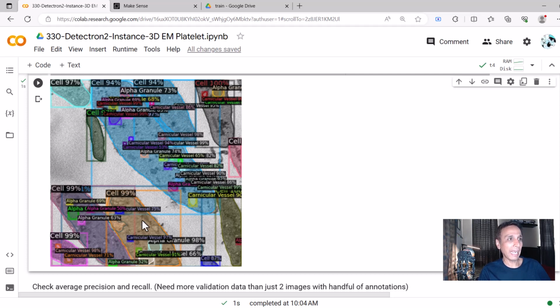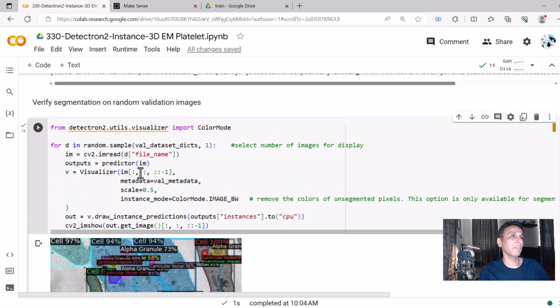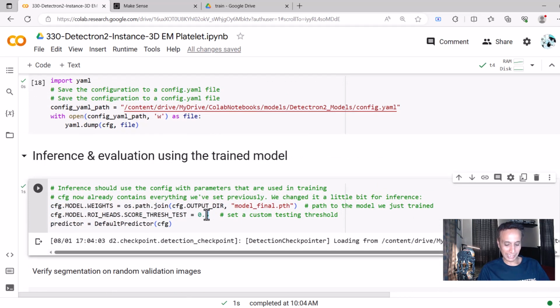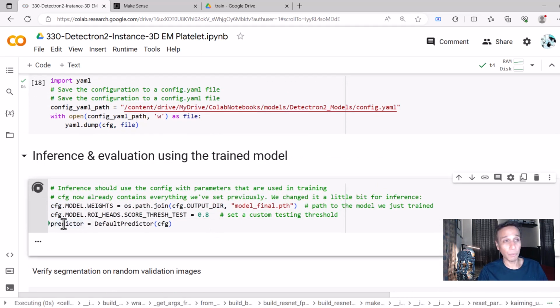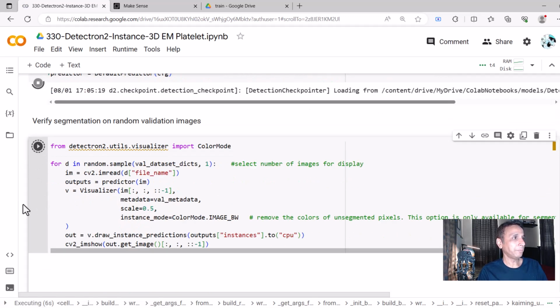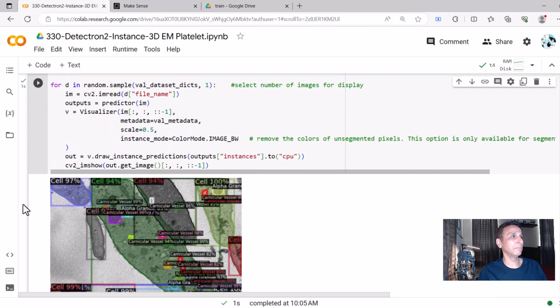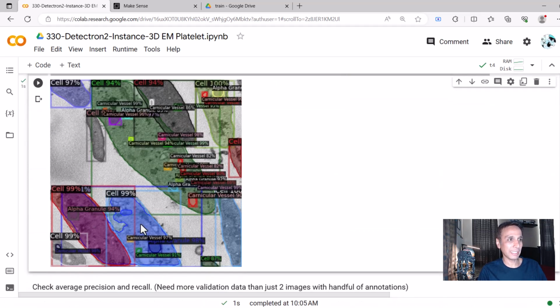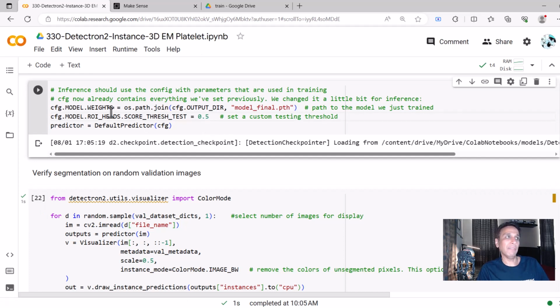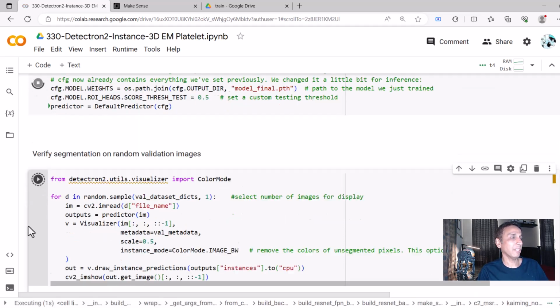But if you think half of the cell is, let's go ahead and do that. Why not? I was about to say, let's change this to 0.8. Very aggressive. So you can see how the output looks. And after that, let's plot it. We should see some objects dropped, and you see this cell, how this region is not picked up as a cell, and things can be a bit weird. It's not perfect right there. So this is very aggressive. Let's go back to 0.5 and run this.